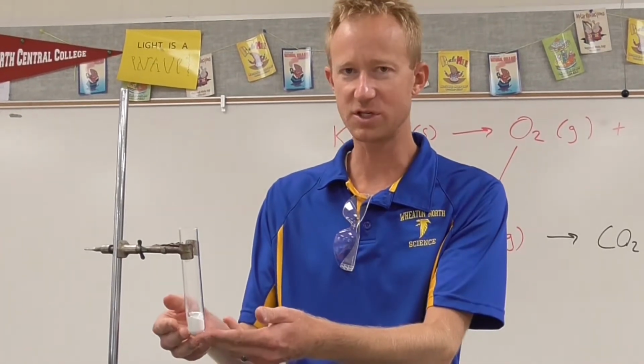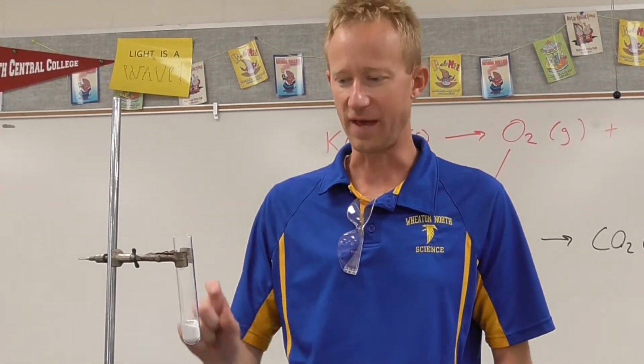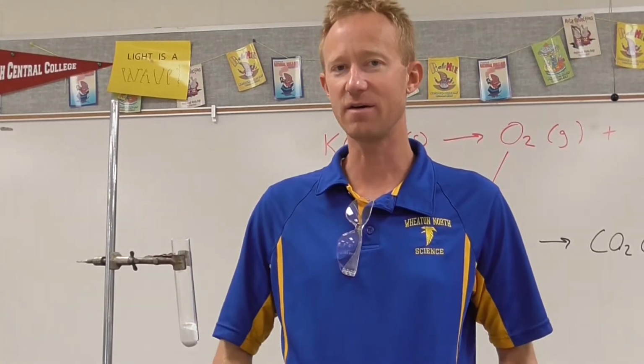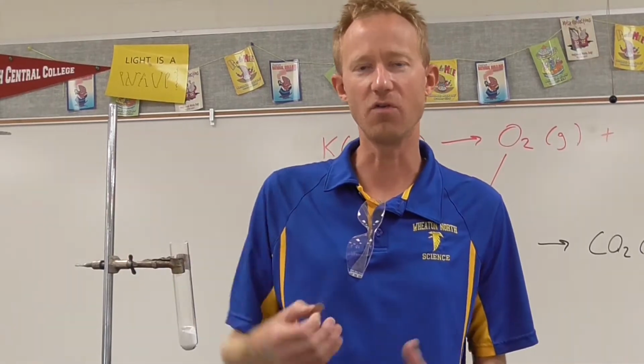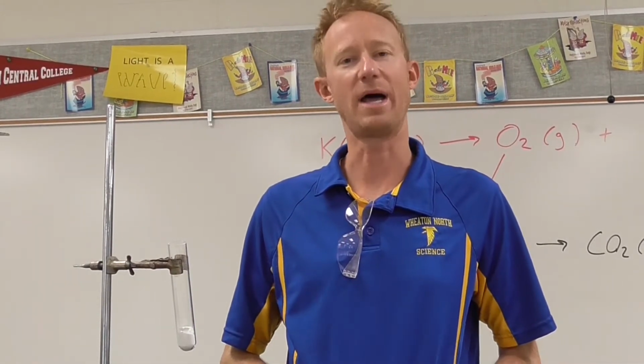We're going to heat this test tube up. We'll initiate the decomposition of the potassium chlorate. That will generate an abundant supply of oxygen gas. And then when we drop the gummy bear in, we have all that's necessary for a dramatic combustion reaction.